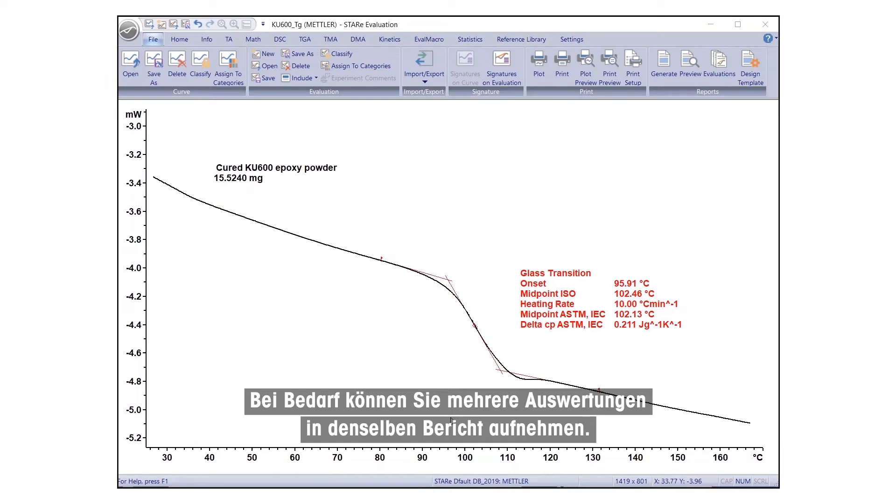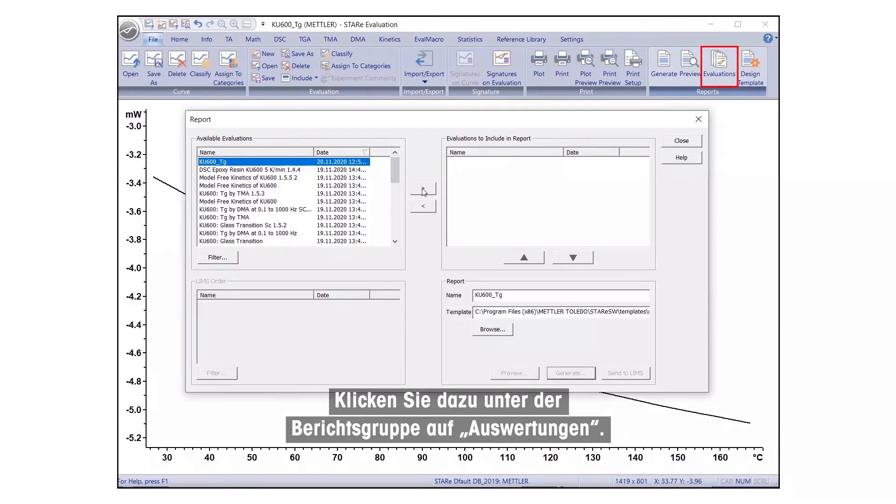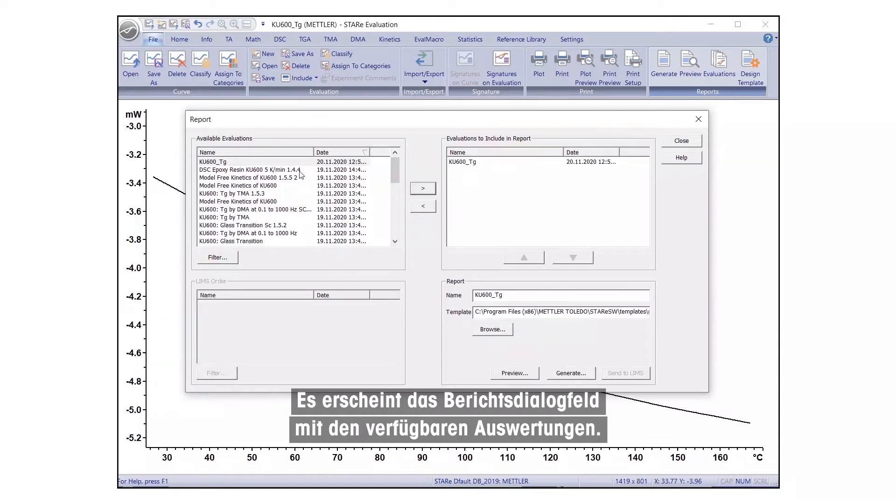If needed, you can include several evaluations in the same report. For this, under Report Group, click on Evaluations. The Report dialog box will appear, listing the available evaluations.